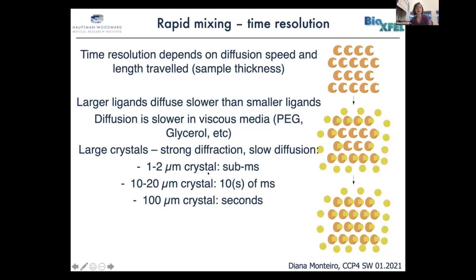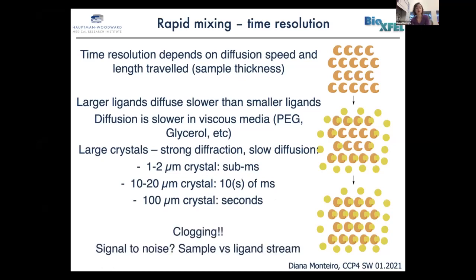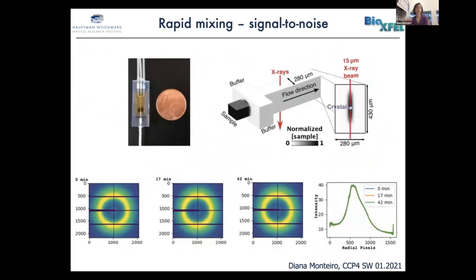In terms of coupling fluidics to mixing, one of our biggest enemies forever is clogging. As soon as you start increasing the size of your crystals, you can run into problems with this. So everything has to be really tested before. And signal to noise, this is something that we were also worried about for the fluidics.